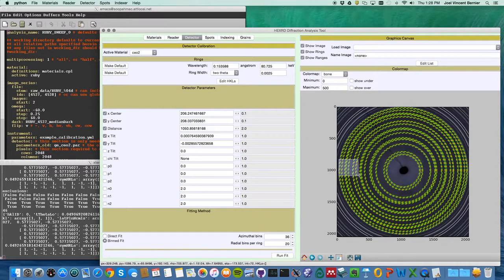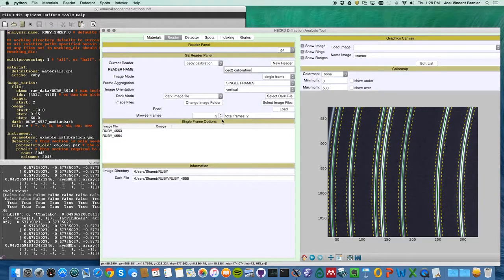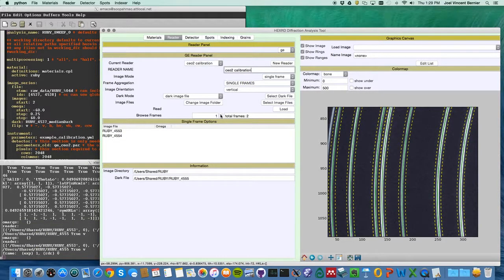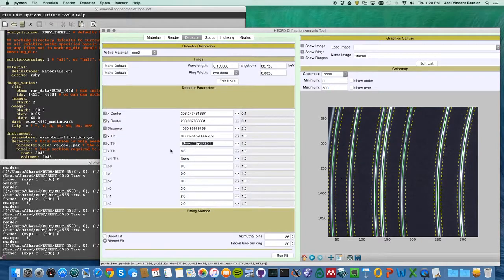Just to double check, when I look over my images, since the images are at different distances, it's good to make sure that things don't fall off the detector. This one is pretty near the center, so it hardly moves between frames. So that's fine. Now with that entire data set, let's refine these first 3 coefficients for the detector distortion.